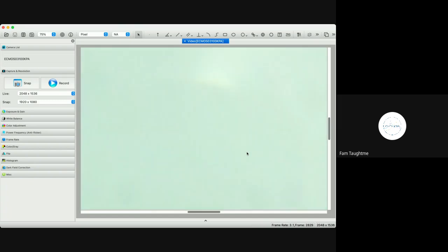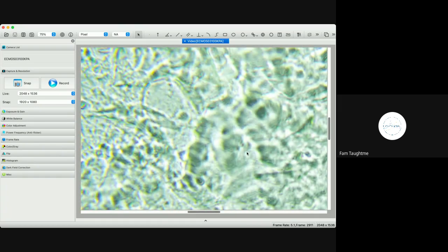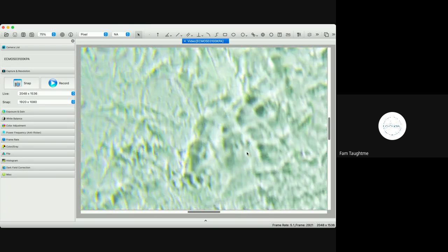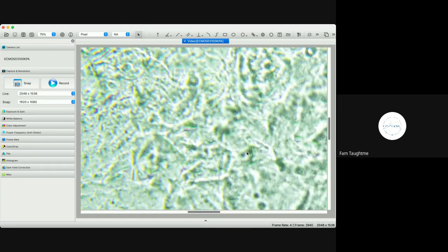Let's see what else is on here. Oh, going off the slide, sorry. Anything over here? Oh, what's over here? This was me every night for two months. I would spend an hour on this each day.